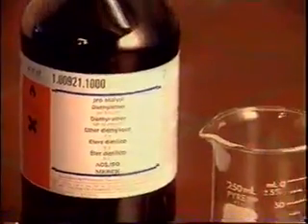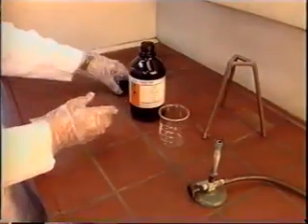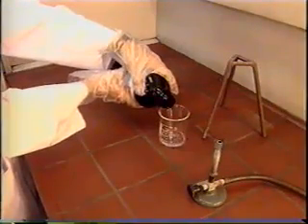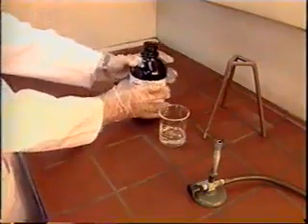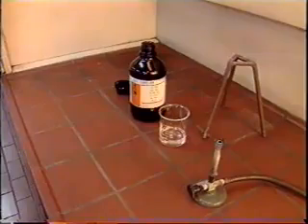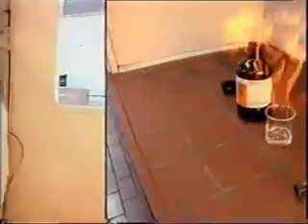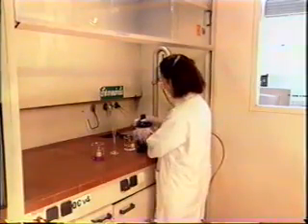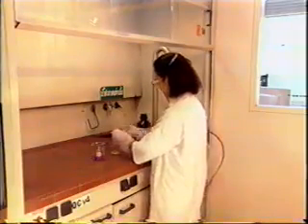Highly volatile solvents evaporate quickly. If the vapors are exposed to an ignition source, a fire will result, even if the source is not near the solvent. So if you work with flammable solvent, make sure that there is no source of ignition close by. To avoid the buildup of any flammable vapors when working with highly flammable solvents, work in a fume cupboard.